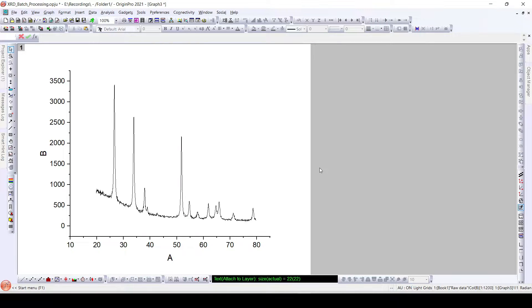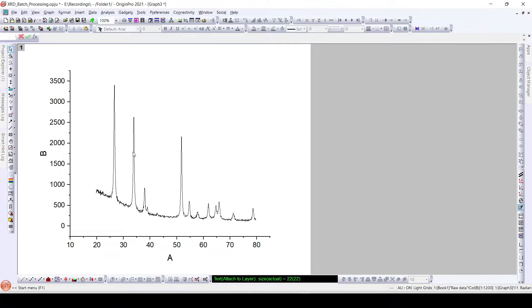Hello friends, today we are going to calculate the degree of crystallinity of a material using XRD. Degree of crystallinity can also be considered as the signal to noise ratio. Here the sharp peaks are the signals, and the noise comes from the other areas in this XRD pattern. The higher this signal to noise ratio, the higher will be the degree of crystallinity.